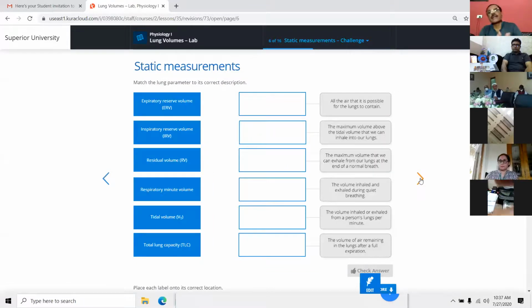It is just the calibration of the equipment, and calibration is for each and every person, who has a different chest cage size. Some have small, some have large. So this sensor will calibrate the size of the chest for the first reading.